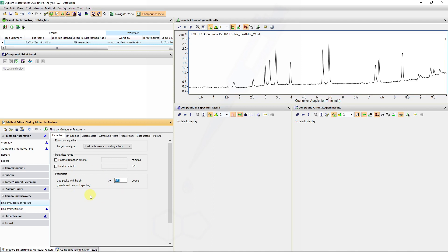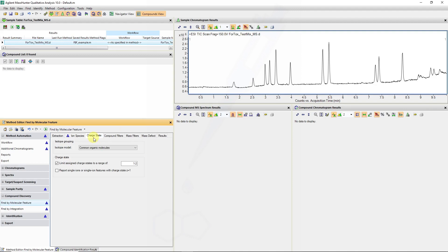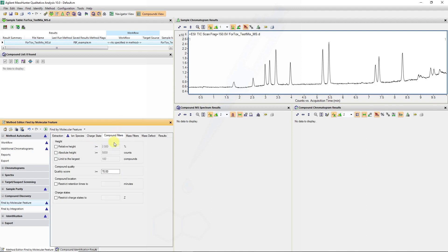The first filter applies to extracted spectra, and subsequent menus have values applying to the chromatogram features. Under species, we will be looking for the protonated and sodium adducts in our positive data file. For charge state, we will deal with common organic molecules, and these settings will be kept at default.